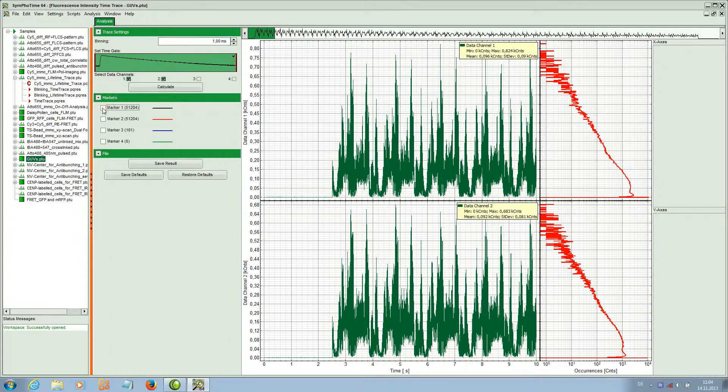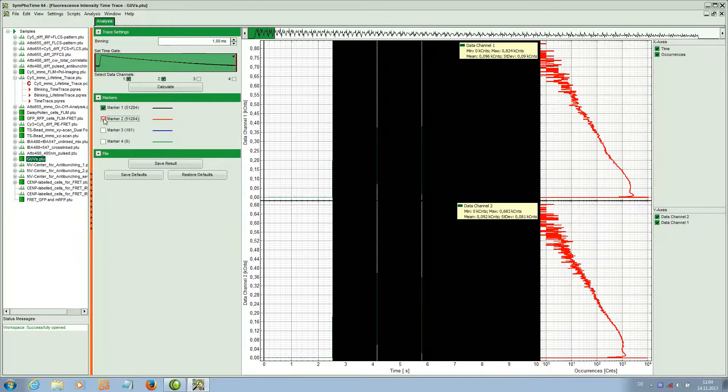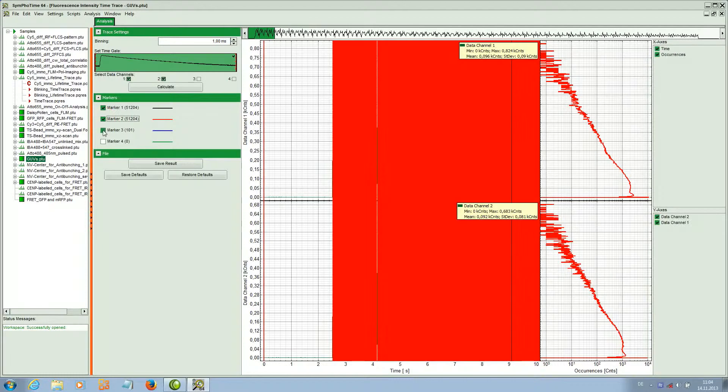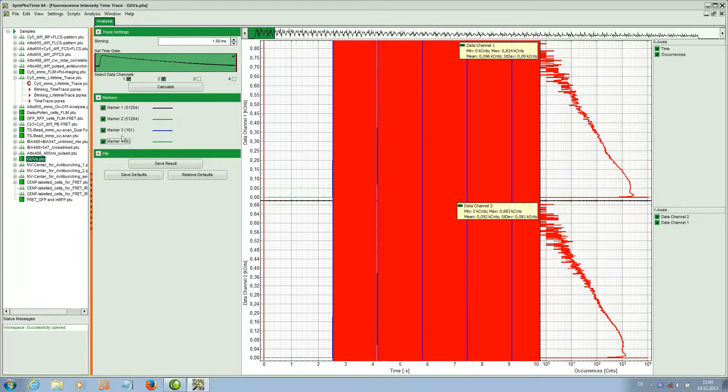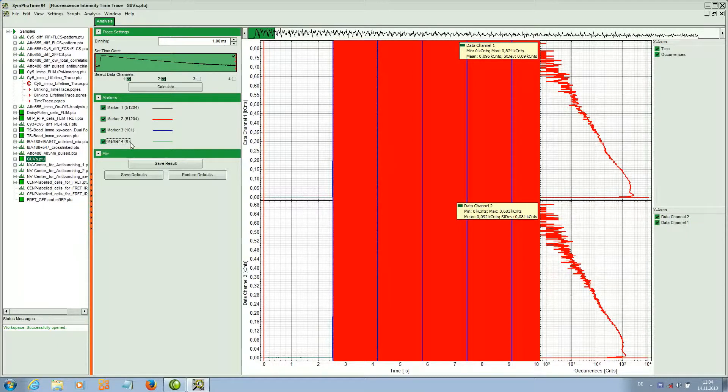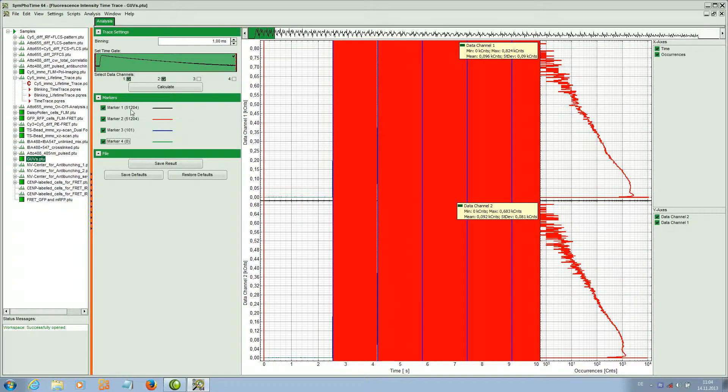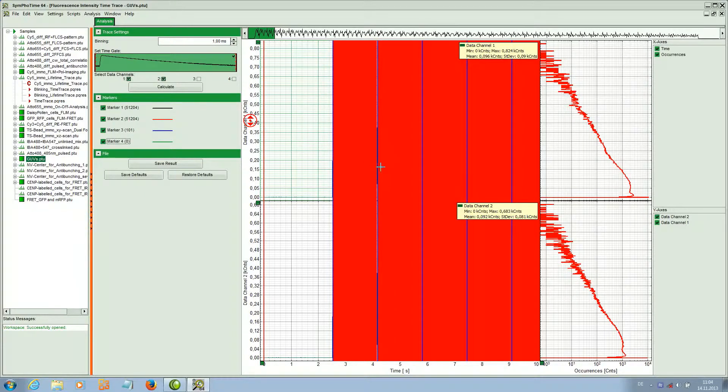A big advantage of the time trace script is that you can display the marker signals here. If something is wrong in your scanning you can check whether all the marker signals are there. Marker 4 is not used, marker 3 is the frame marker, and markers 1 and 2 are the line start and line stop markers.